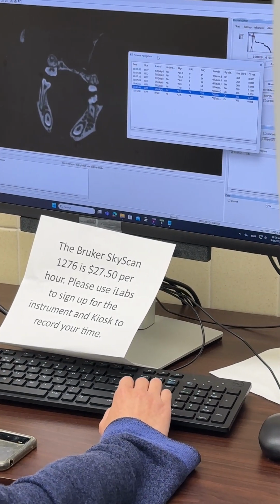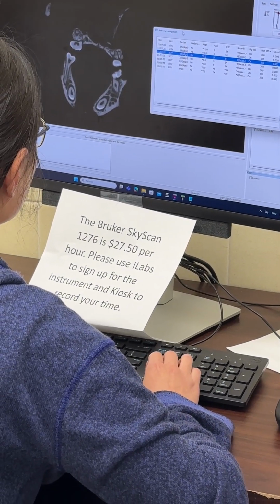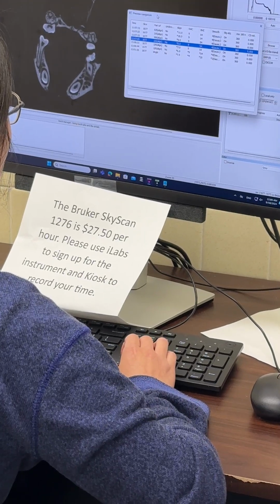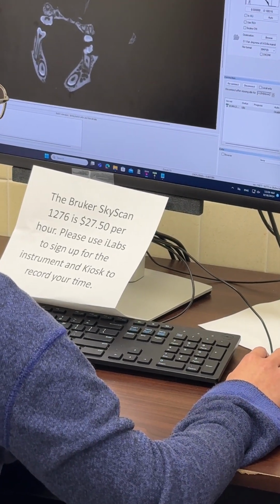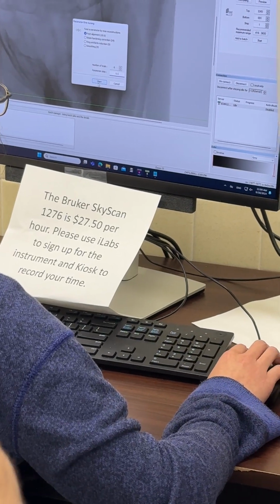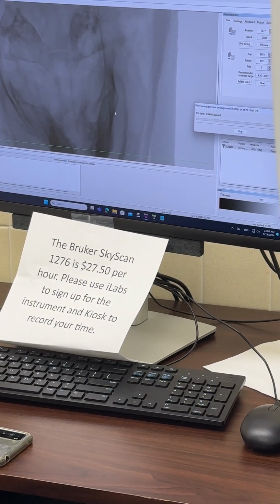You may notice if I put it to 6, it's pretty blurry. So we go back to 7.0, 8.0, 9, 10, 11. I think 9 or 10 is around there. Pretty similar to 8 or 9 or 10. So I put it in 10 or 9. I will repeat this step, fine tuning, and try 0.5 each step. So it will give us a number like 9.5, 10, 10.5, and below is 9 and 8.5. We'll see which one is the best one.